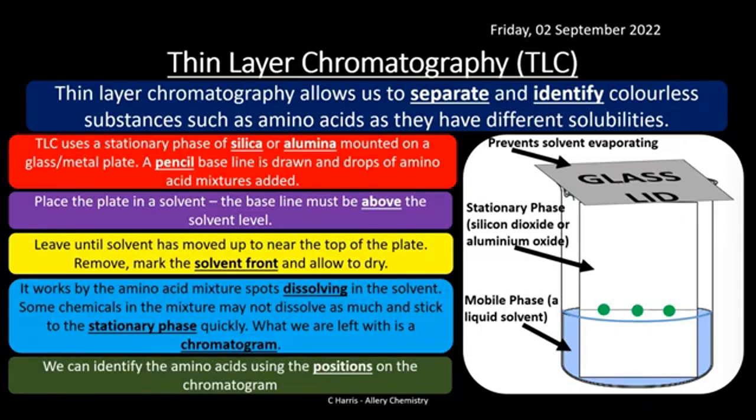In this case, the compounds are not colored. TLC uses a stationary phase of silica or alumina, mounted on a glass or metal plate, so it's a little bit different. A pencil baseline is drawn, and drops of amino acid mixtures are added to the bottom, so it looks very similar to a paper chromatography setup.